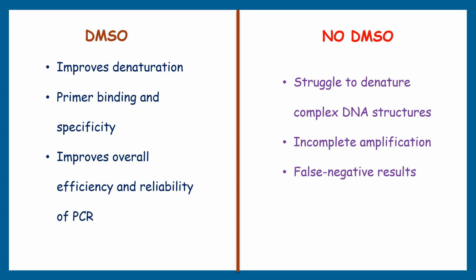But it's important to note that the optimal concentration of DMSO may vary depending on the specific PCR reaction and DNA template being used. So we should carefully optimize the DMSO concentration to achieve the best results.